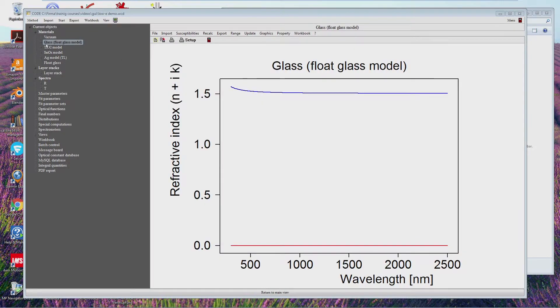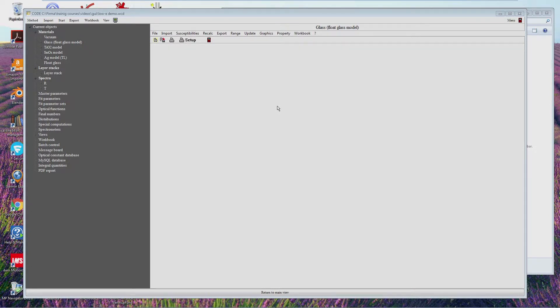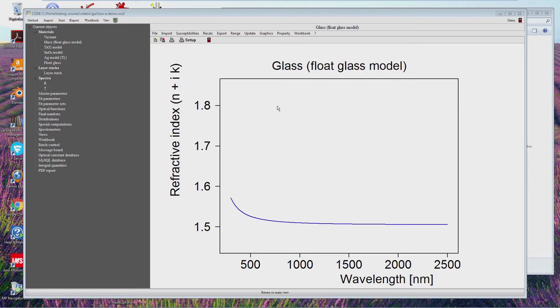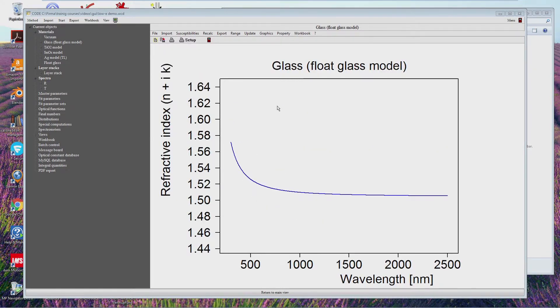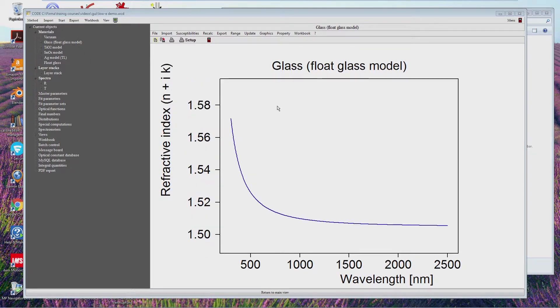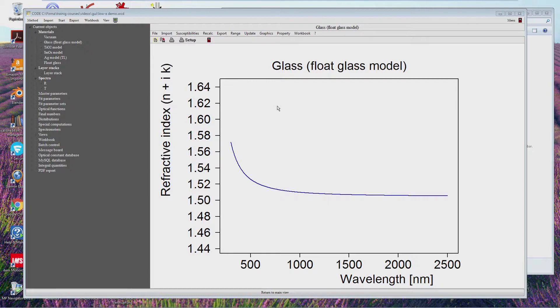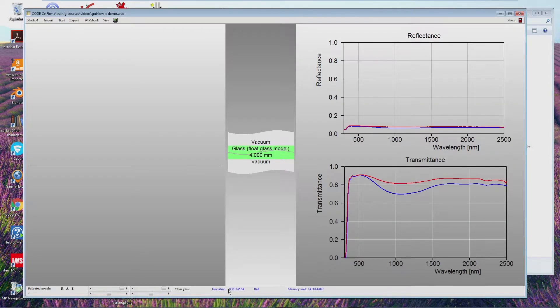Now we have a model for the optical constants. We can take a look at the real part here, and if we zoom in, there is no noise — it's a very nice, smooth curve. This is what I prefer when I determine optical constants. Pressing F7 shows that the blue simulated curve is not really reproducing the red measured curve, but you can see all the features are there. The blue curve is a little bit too deep — the absorption features are too strong. We have to make them weaker and then it should work out.